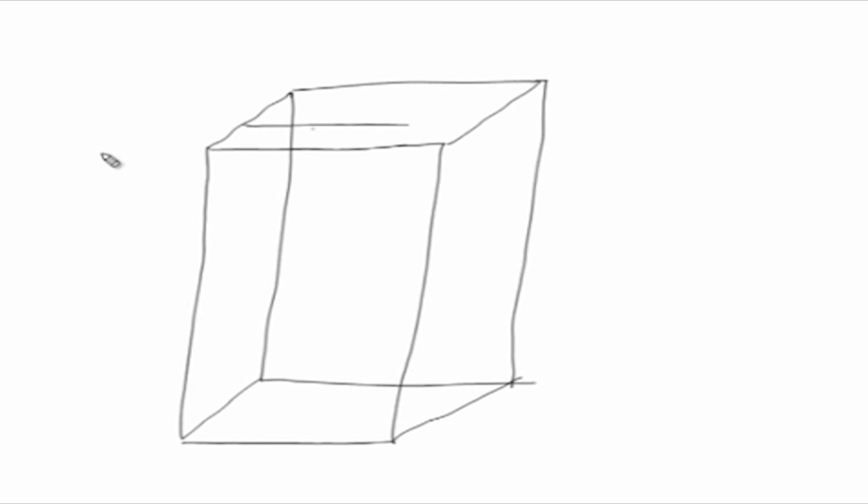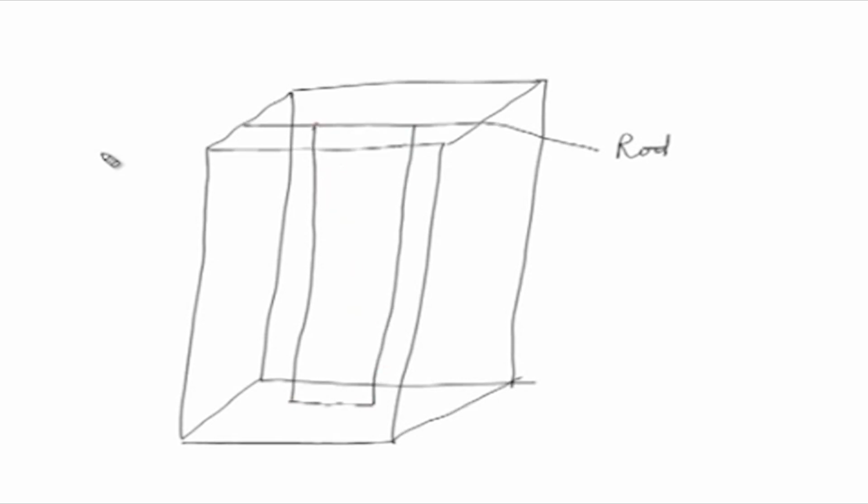If I can have a rod to support the paper, this is a rod to support the paper. Now, you have a paper which is hanging, or it is supported paper which can remain straight in here. The jar has to be sealed completely. The main aim of having a rod or a support system is to keep the paper straight.